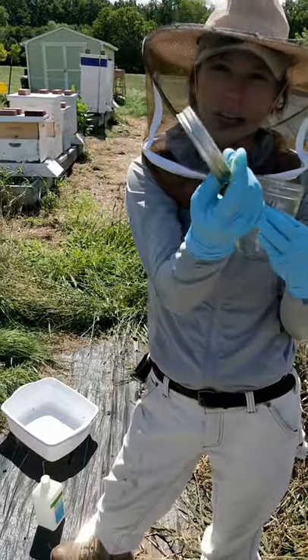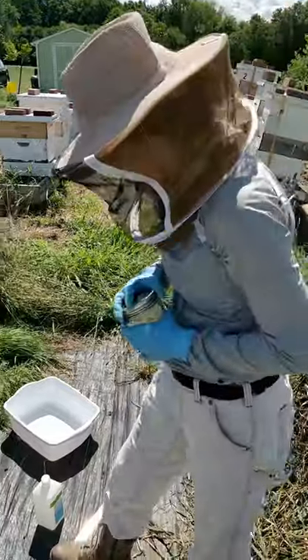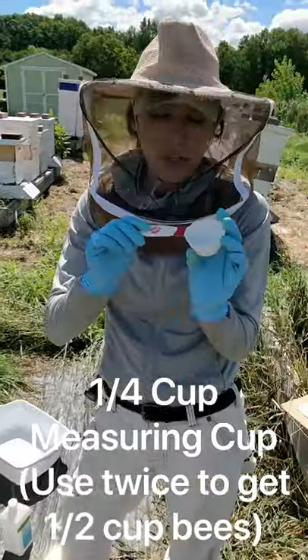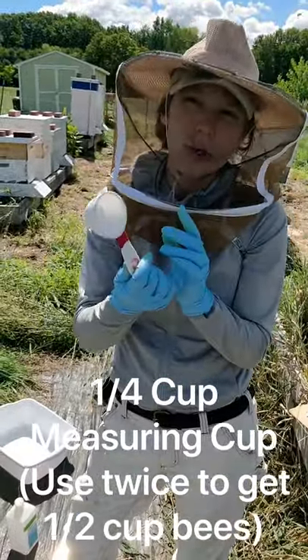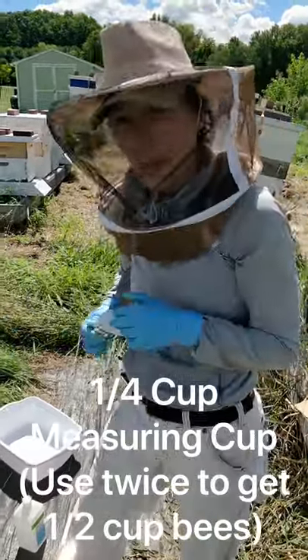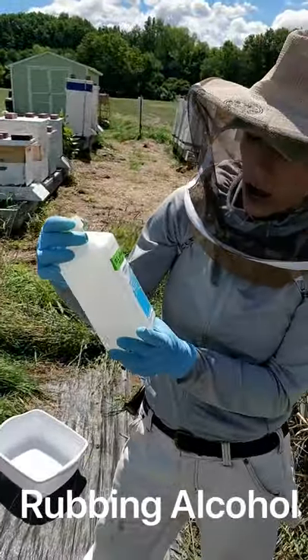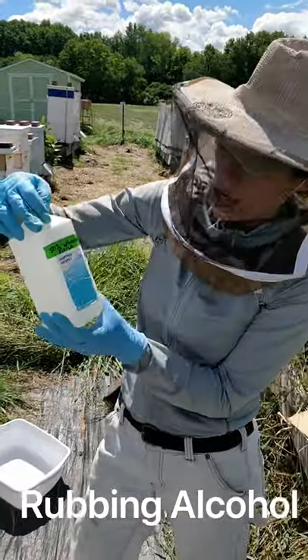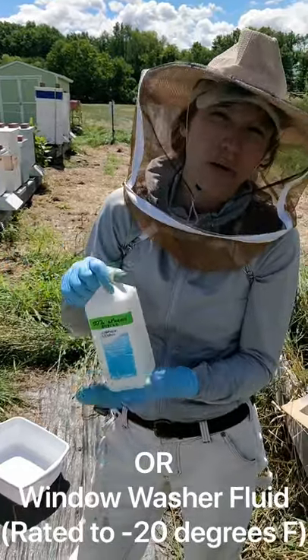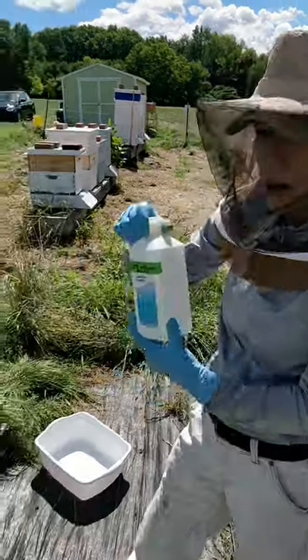I'm going to put the lids together right here. I also have a measuring cup — you're going to get a half cup of bees, but I like to use the quarter cup because it fits in the jar better, so I'll just do two scoops with a quarter cup. And then I have my bottle of alcohol. You can get rubbing alcohol from the store — this is 50% ethanol. You can also use windshield washer fluid, which works really well, but just make sure it's rated to negative 20 degrees Fahrenheit. I've got my ethanol poured into this jar.